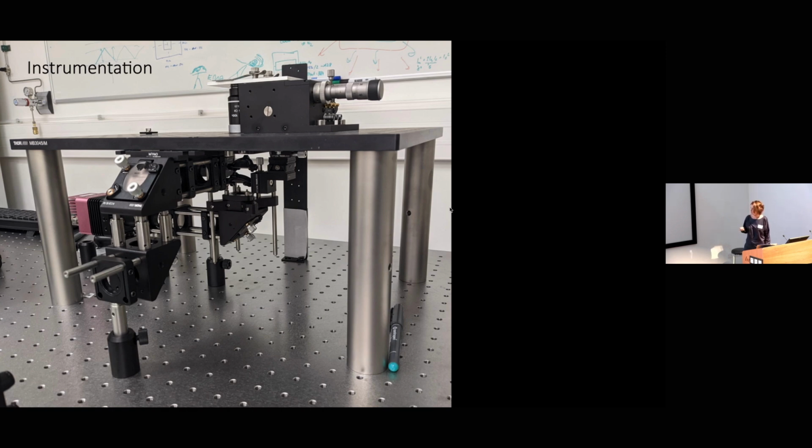But the other reason is that conventional microscopes lack the mechanical stability that we need, and they also lack the efficiency of collection of the scattered light. So, yeah, there are maybe some improvements on the engineering side.